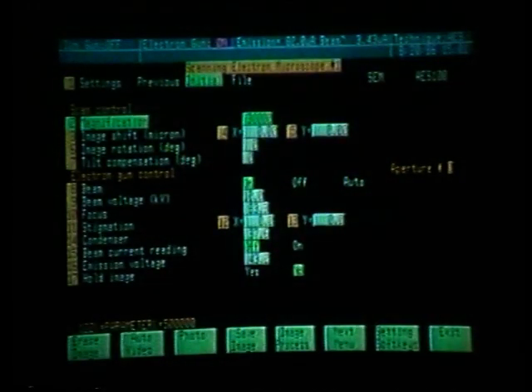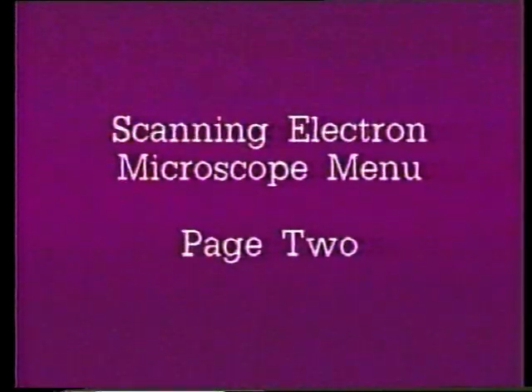Since we will be sputtering, we do not want to saturate the secondary electron multiplier when the ion gun is on. So going back to the computer terminal, we would now like to go to the next menu using soft key number 6.